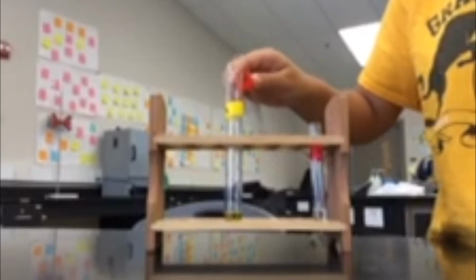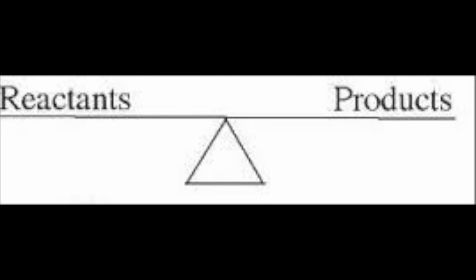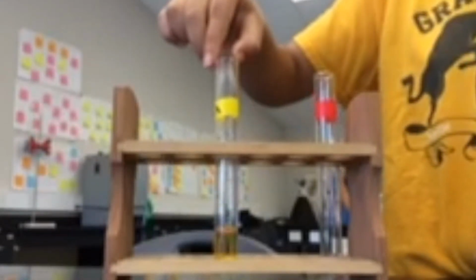When excess H+ ions were added to the system from HCl, more of the chemicals on the product side were added. In order to compensate for this change and once again reach equilibrium, the system shifted left. When sodium hydroxide was added to the system, OH- ions were dissociated and then bonded to the H+ ions. This removed H+ from the system.